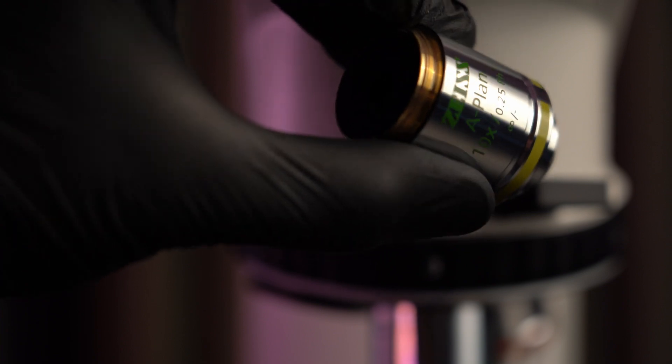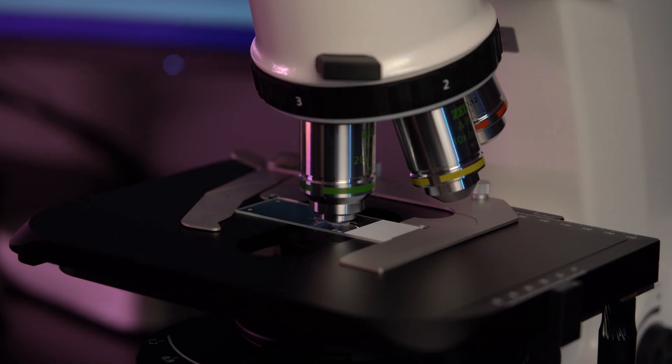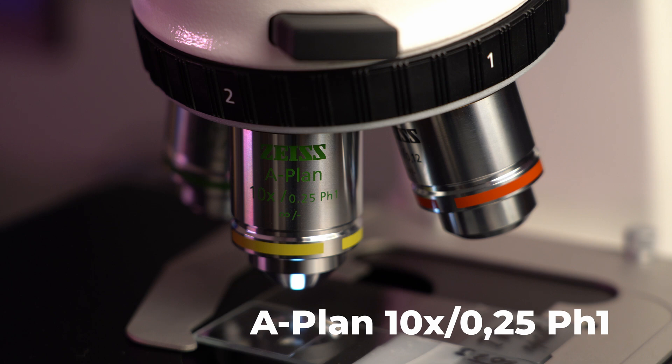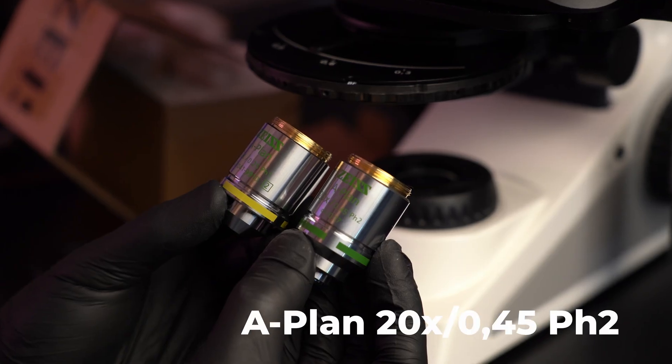By the way, almost all phase objectives have green markings. The phase ring number is also indicated. Here we have 10x magnification lens with a PH1 mark and 20x lens for the second phase ring PH2.